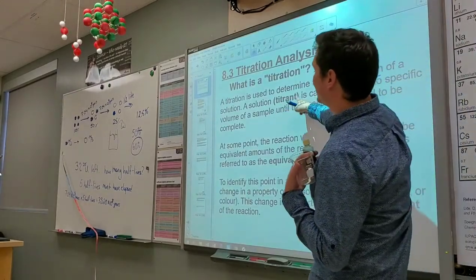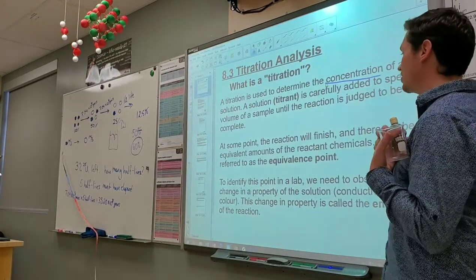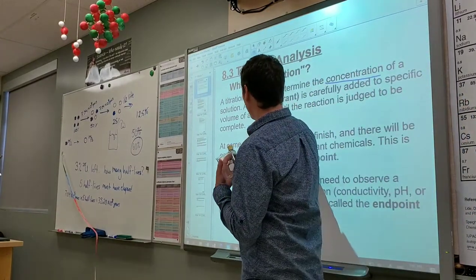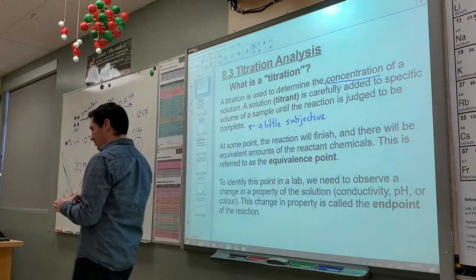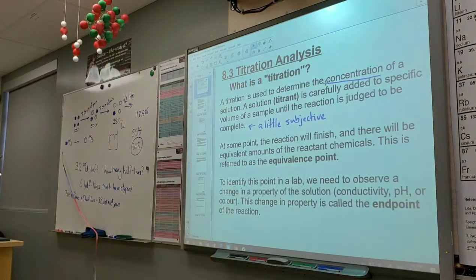Now, a solution or a titrant is carefully added to a specific volume of a sample until the reaction is judged to be complete. That's a weird phrase because "judged to be complete" is a little bit subjective. Do you know what the term subjective means? It means influenced by opinion or perspective or feelings. Objective means truth, there's one answer. But subjective means that could be this, could be that.